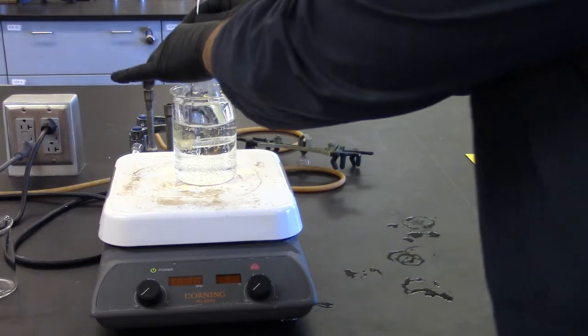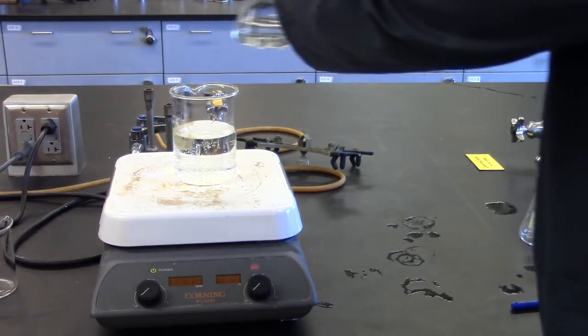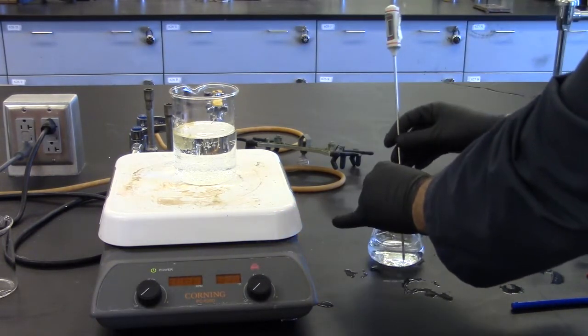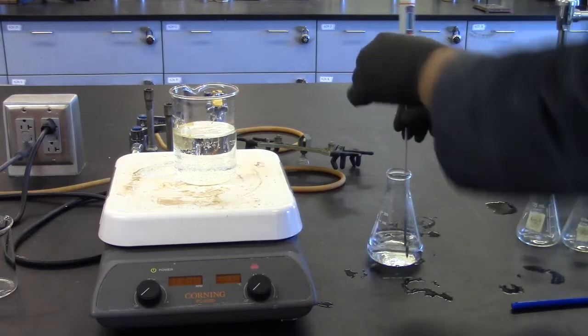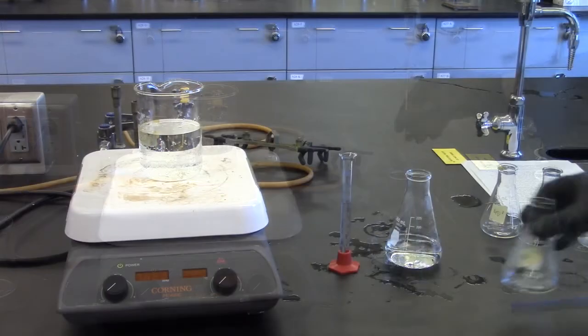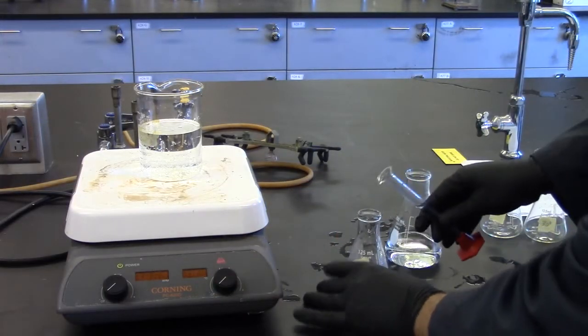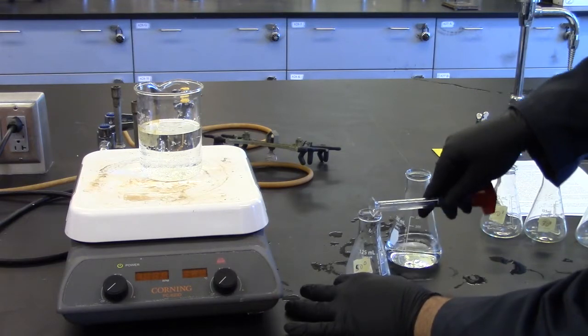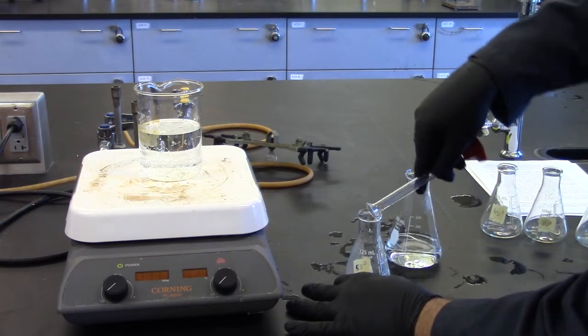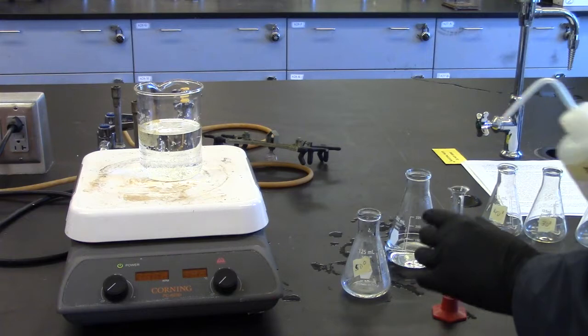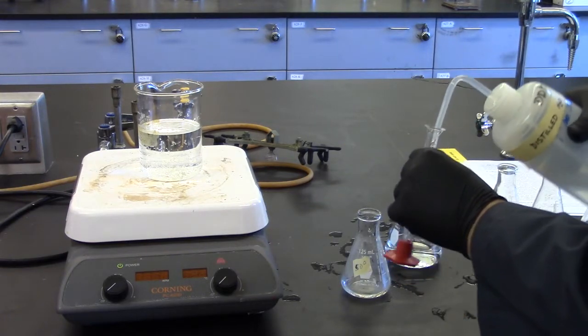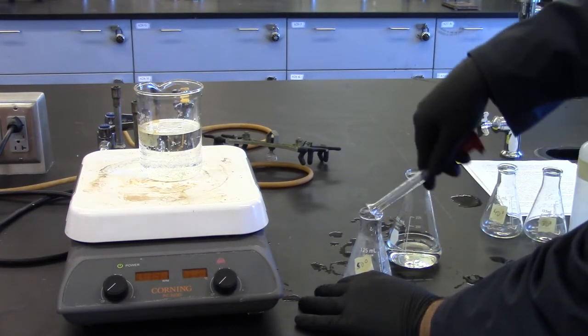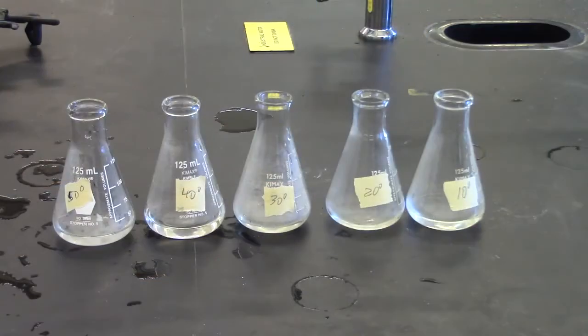Now, remove the flask from the bath and let it cool gradually, swirling it frequently, and monitor its temperature. Transfer this solution into your first flask marked 50 degrees Celsius. There may be borax left in the cylinder. Rinse this with distilled water and add to the flask.